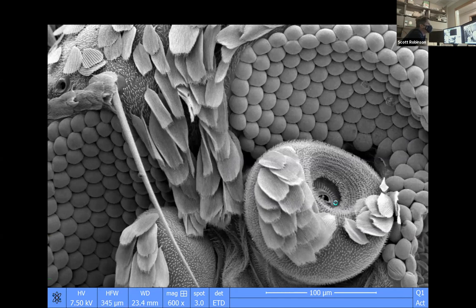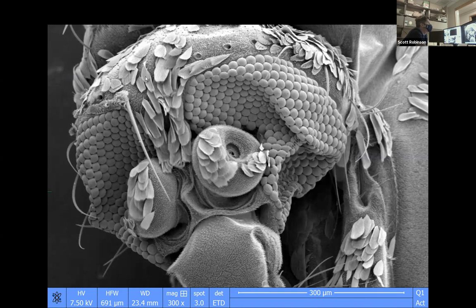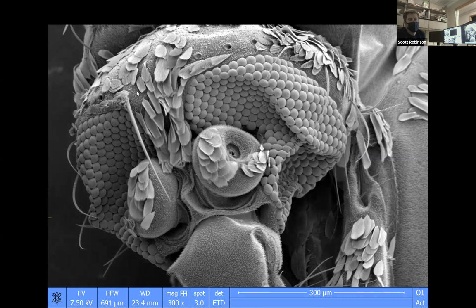Yeah. So these are the compound eyes of the mosquito. You can see that the mosquito also has little scales on it, like we looked at earlier. Scales are interesting because sometimes they're colored, like on the wings of butterflies and moths, and sometimes scales are just kind of like these gray accessory-like things.